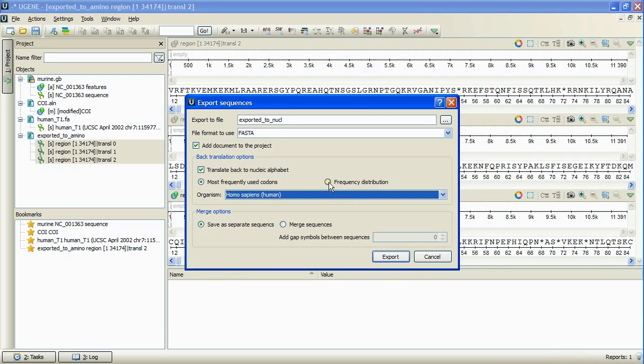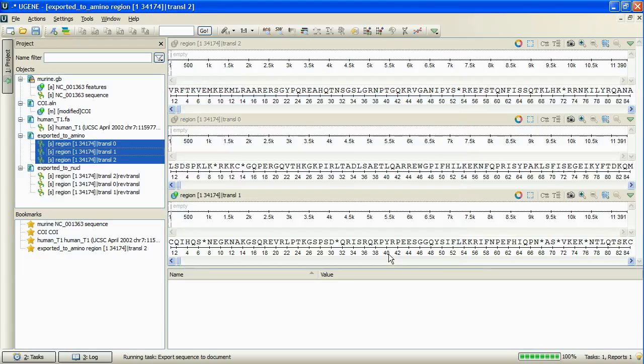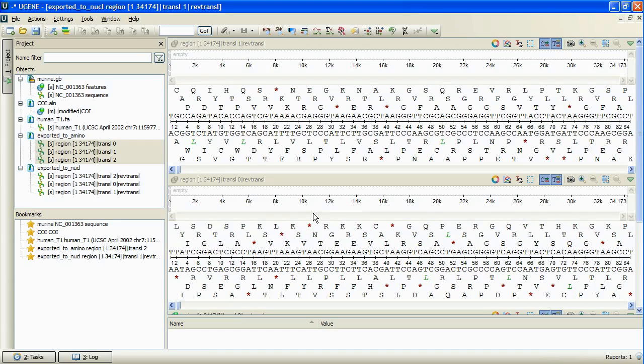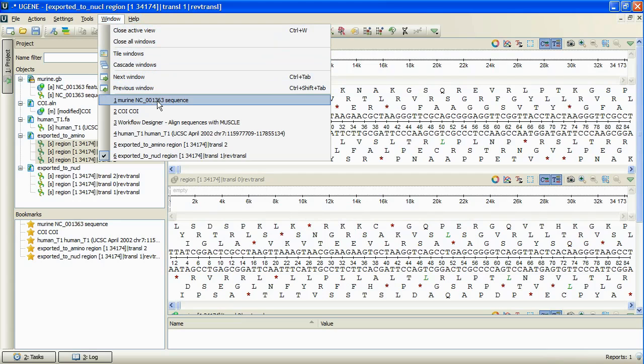Selecting the frequency distribution option leads to translating with frequency distribution, where the more frequently a codon is used, the more probably it will be the translation for the amino acid.